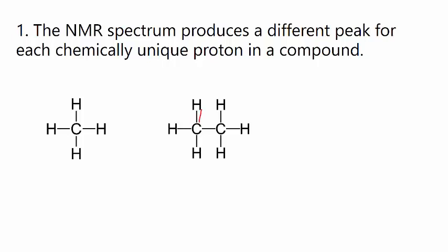Here's a carbon with a hydrogen one away. Here's a hydrogen one away from the carbon, a hydrogen one away from an identical carbon, right? This is a symmetric molecule. Hydrogen one away, hydrogen one away.